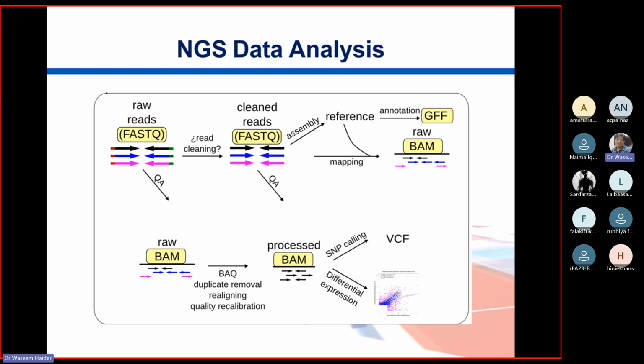It has the genome organized into chromosomes, and on that you have the tracks. You have the tracks for the genomic regions, and for protein coding genes, and the next track is where you can see their RNAs or their proteins, right? That thing is called a genome browser.